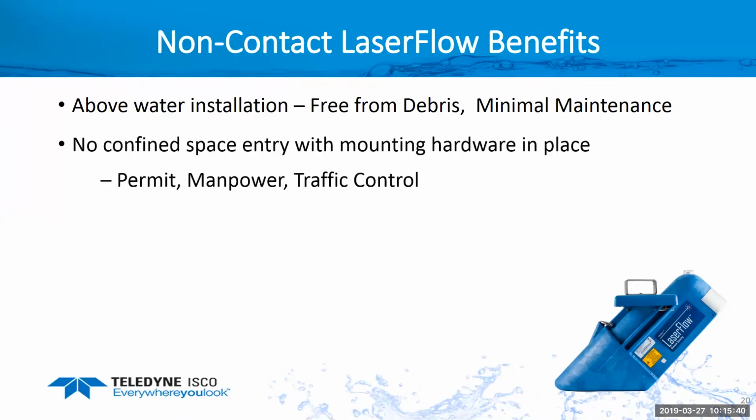This also allows us to do non-confined space entry with the mounting hardware in place. So you do have to get in there and get the mounting hardware put in place for the first time, but you can do that under good weather conditions, or when you have a lot more people there to help you out. But when you have one person going out there, that one person can actually mount this by himself.